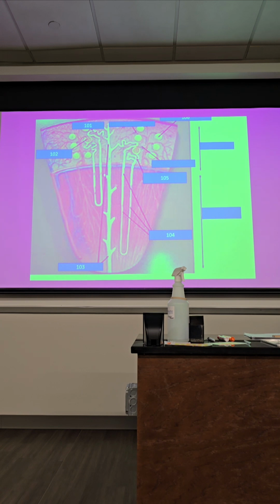Is it the glomerulus? It's hard to see that picture. I get it, it's the open part, where I see filtrates. I see it now.